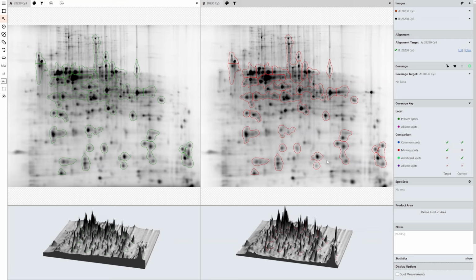Within the 21 CFR or GMP compliant version of the software, we have even greater levels of note taking and note adding at the project level. But this is just the standard version off the shelf. We still have a lot of that functionality baked in because it is designed to be used in QC and QA labs that might not require 21 CFR or GMP compliance.